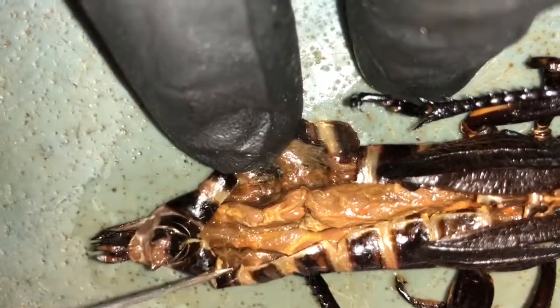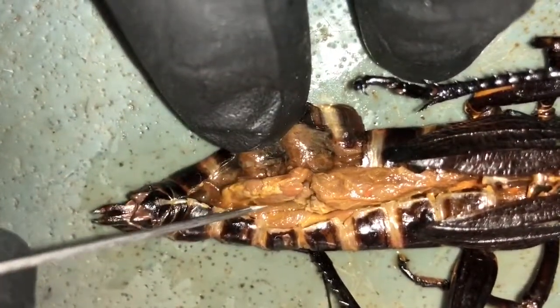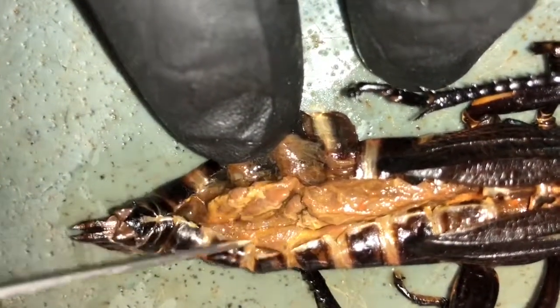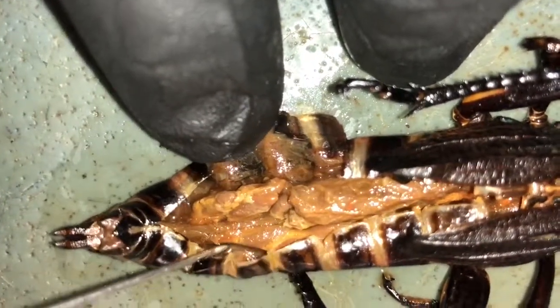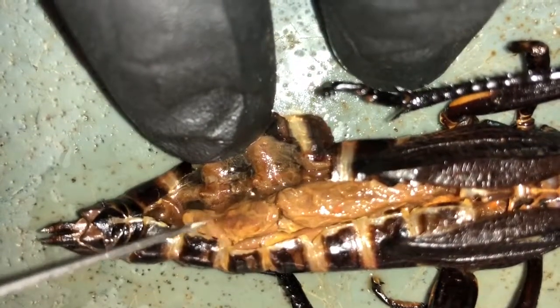No. Move that stuff to your right. Very gently. Your trachea. Your right is the other direction. Do all of this to the right? No. Take the whole glob and push it to the right. Oh, there we go. There you go. Push it very gently.